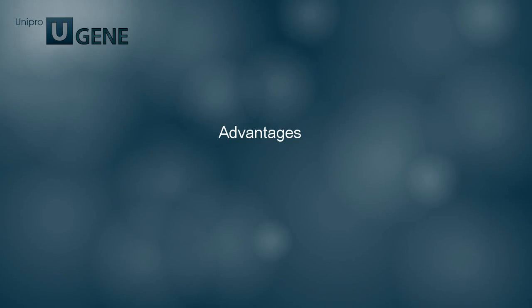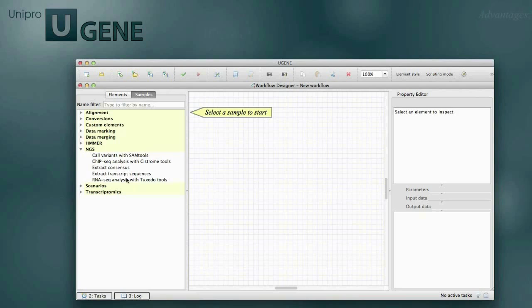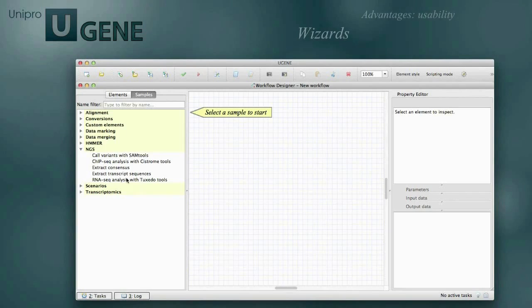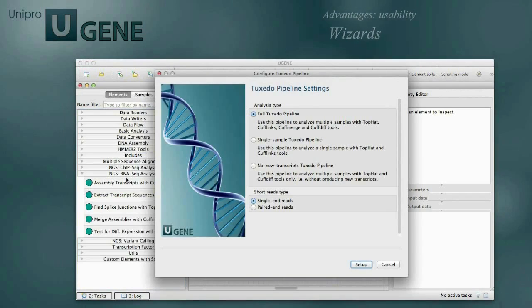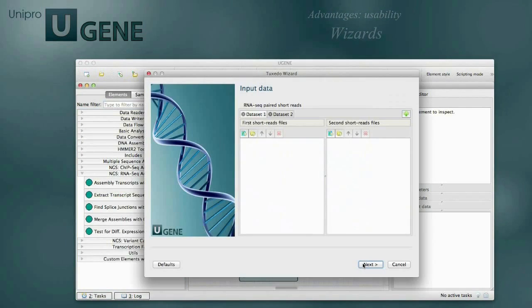By using the NGS pipelines in UGENE, you have a set of advantages over using the original tools. Configurations of the Tuxedo and Cistrome pipelines are chosen in a special dialog before running the workflow.